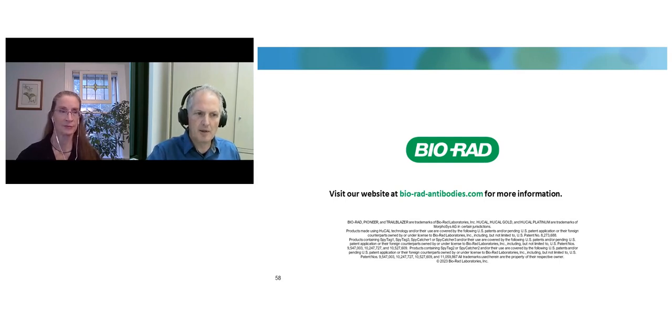You want that your antibodies are equally well expressed and displayed on the library. You want to get rid of empty phages which don't carry an antibody, which can be carried from one round to the next, and basically make the selection step less efficient. So that's what I wanted to show with SpyDisplay, that it works very efficiently and is great for the selection of high affinity candidates. But there's more than the selection technology, of course.